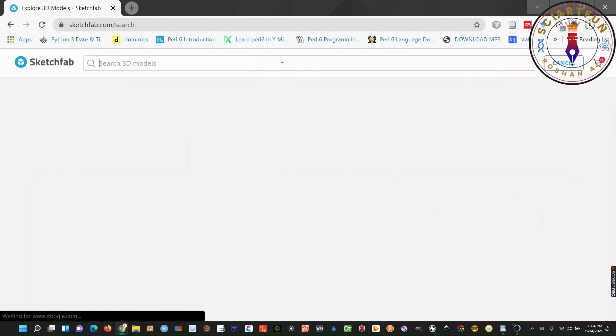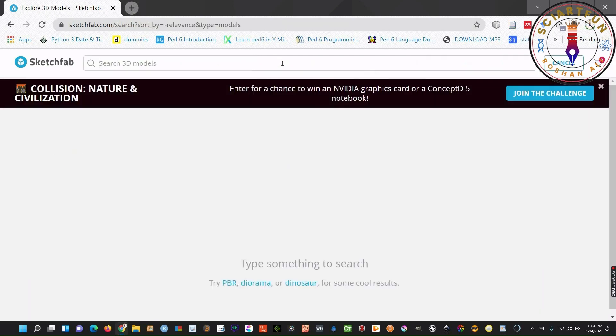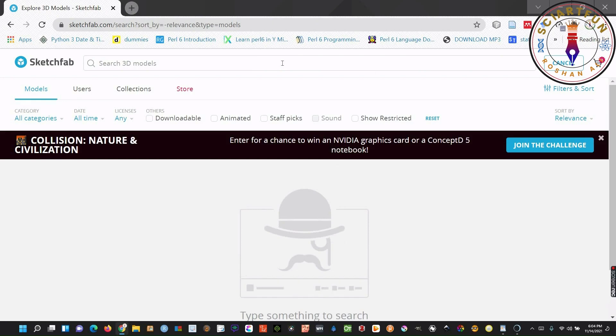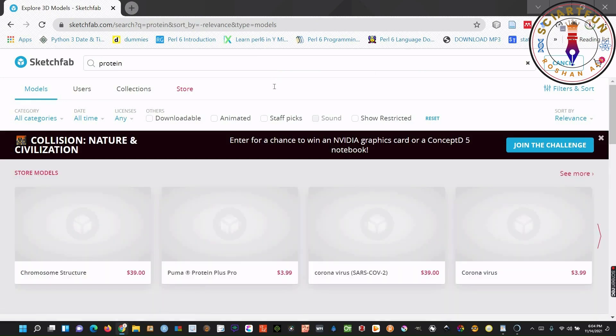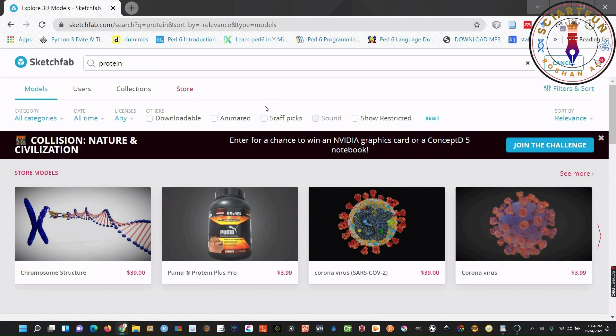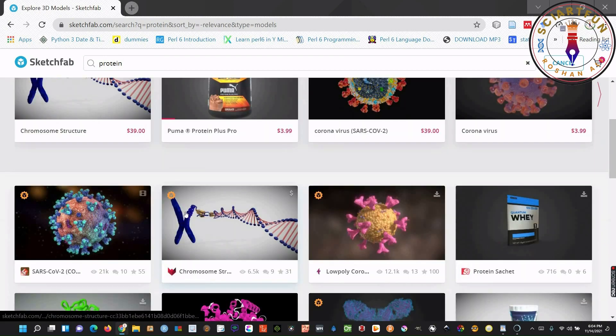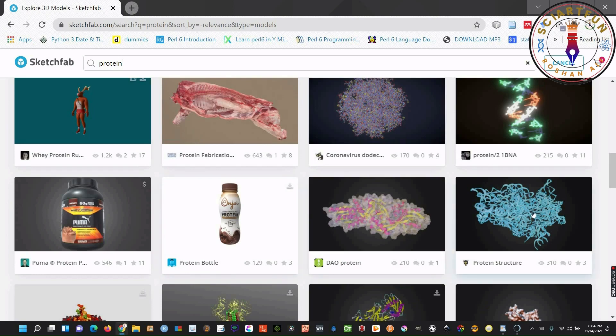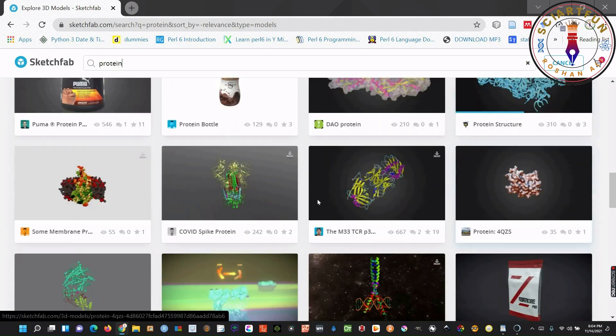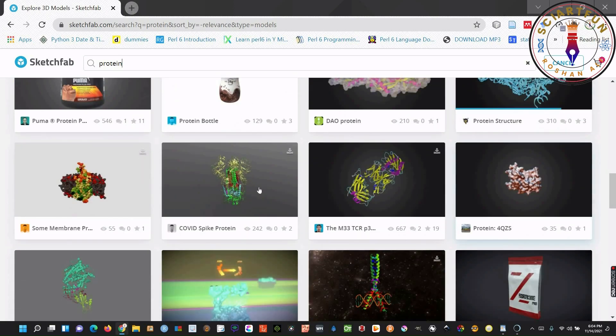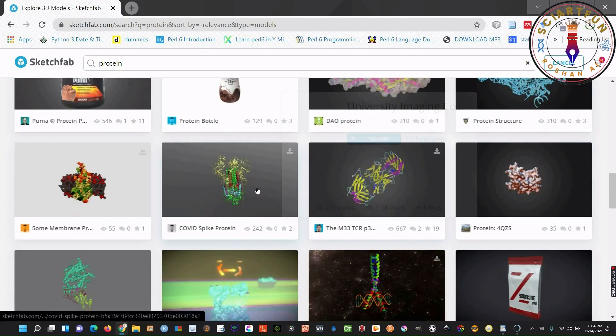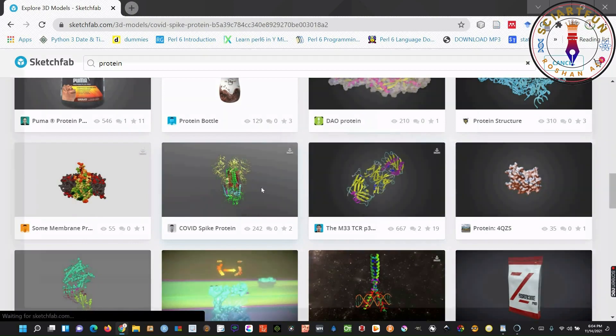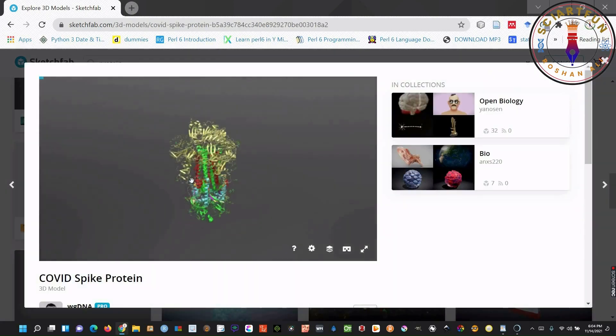These are the categories of different kinds of models. You can select any category to see those kinds of models. You can search for a model here. Let me search for a protein model. Here is what appeared. Let me select one of them. This is the protein 3D model someone has already uploaded.